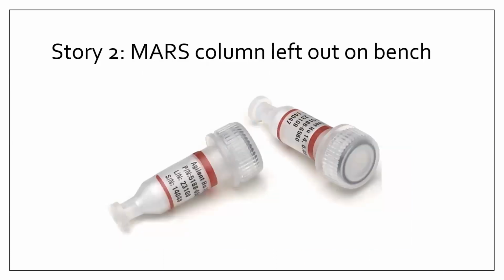Okay, the other thing is another story about Mars columns. The reagent is supposed to be kept in the fridge, but accidentally it was put on the bench for 3 days over the weekend. Gladly my student told me that it happened, and it is good that we know, so we can troubleshoot and learn if there is any bacteria growth over the weekend, or whether we can still purify and pull down the protein as before. So it is important: if an accident happens, just let us know and we can figure it out from there.